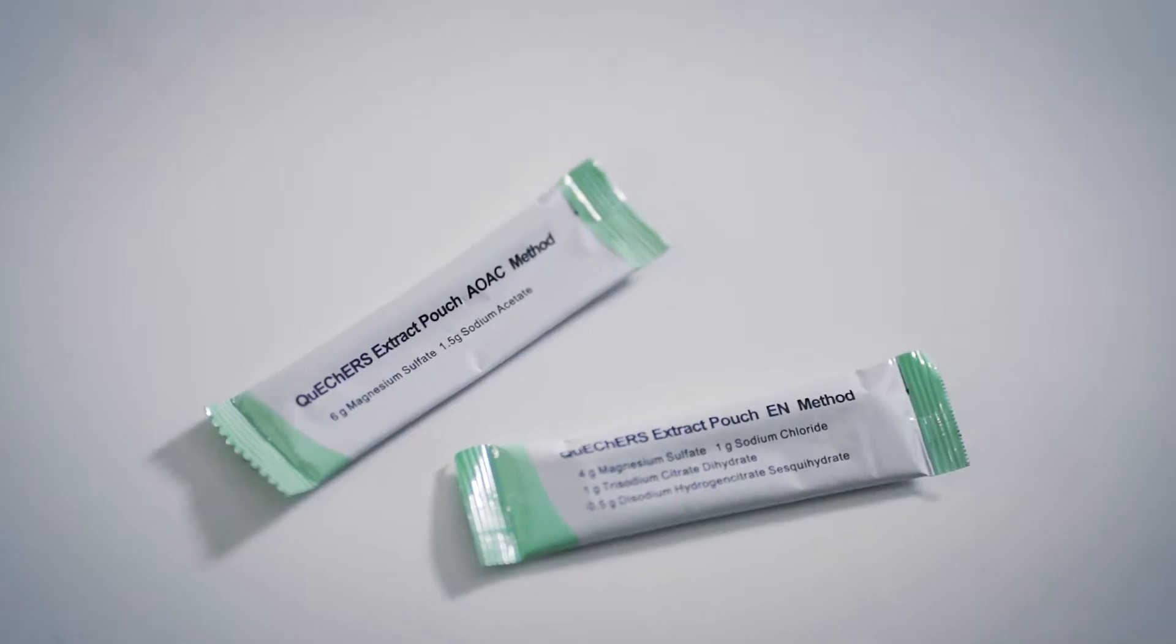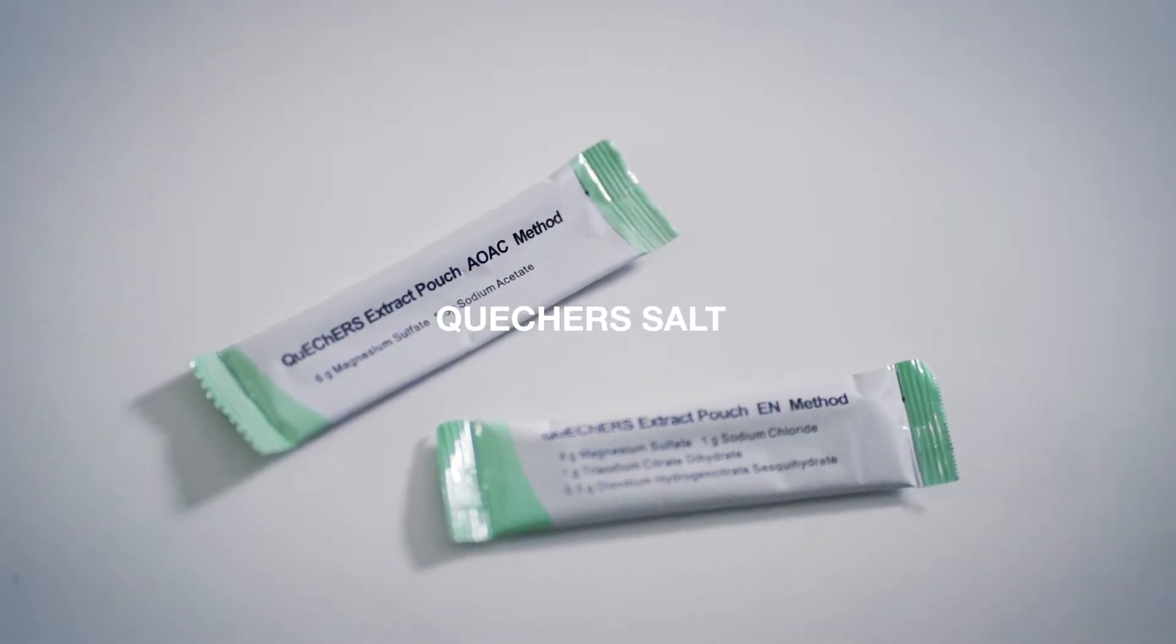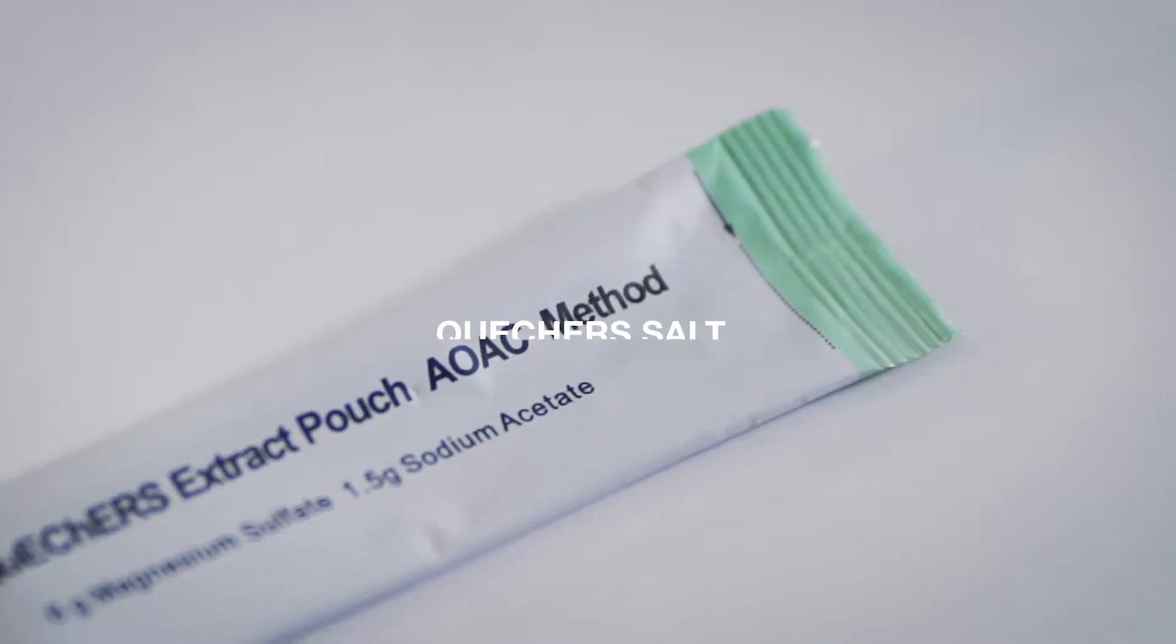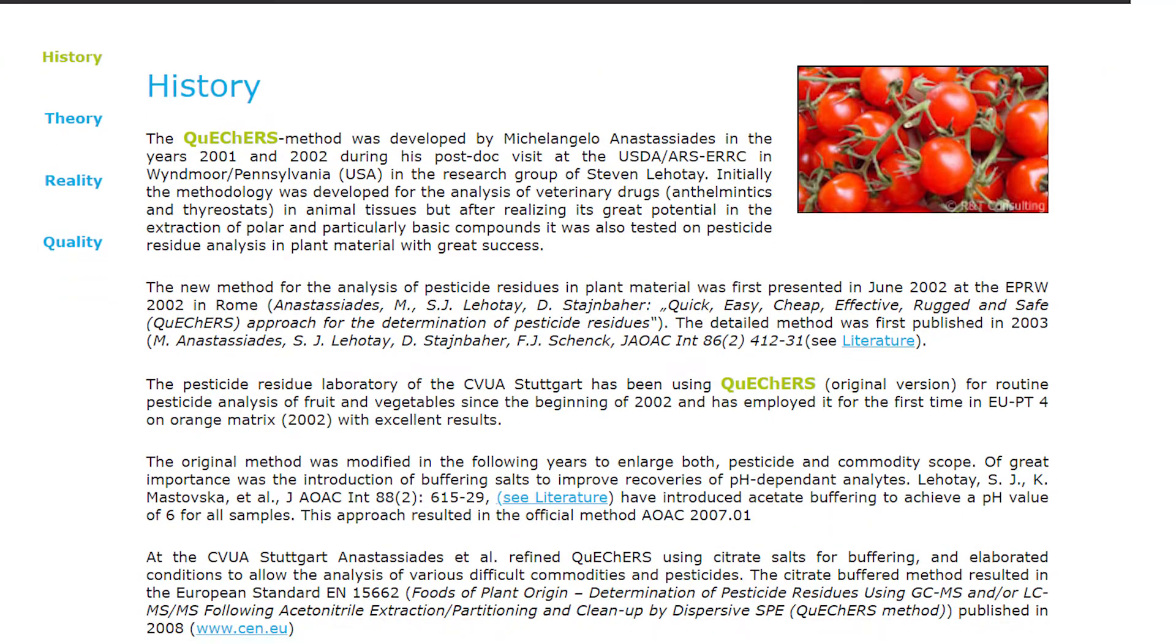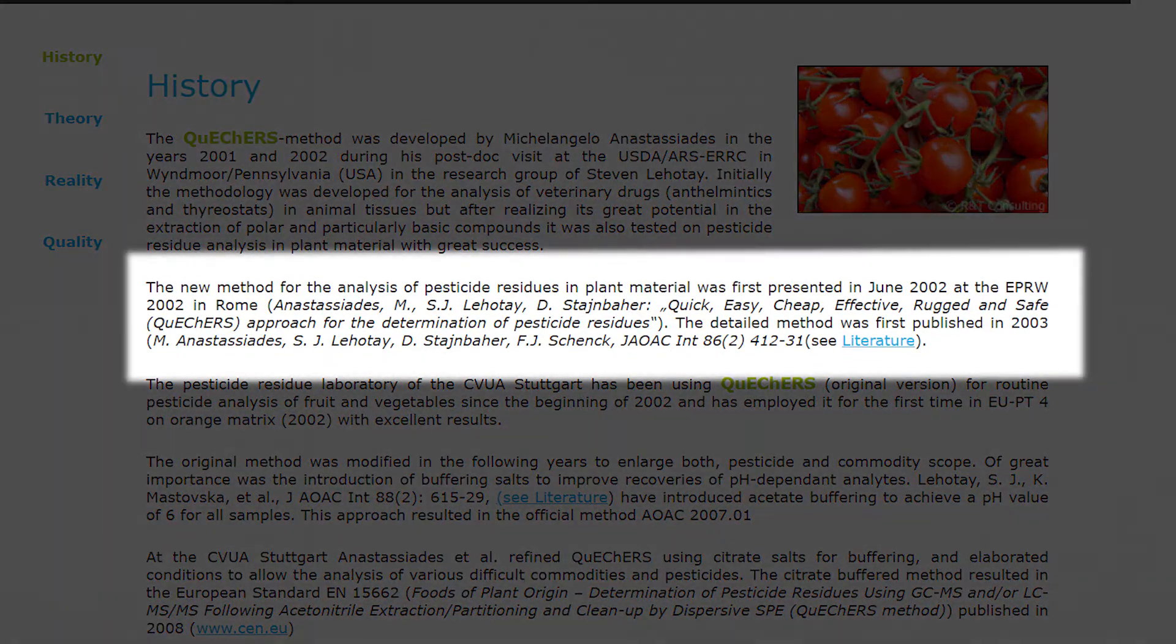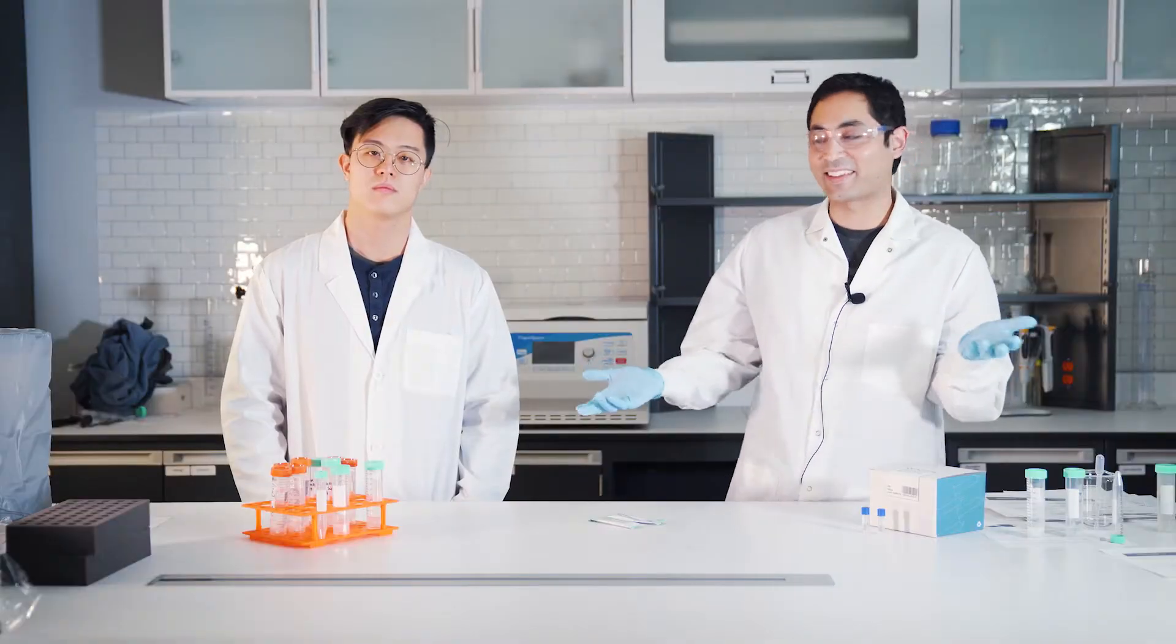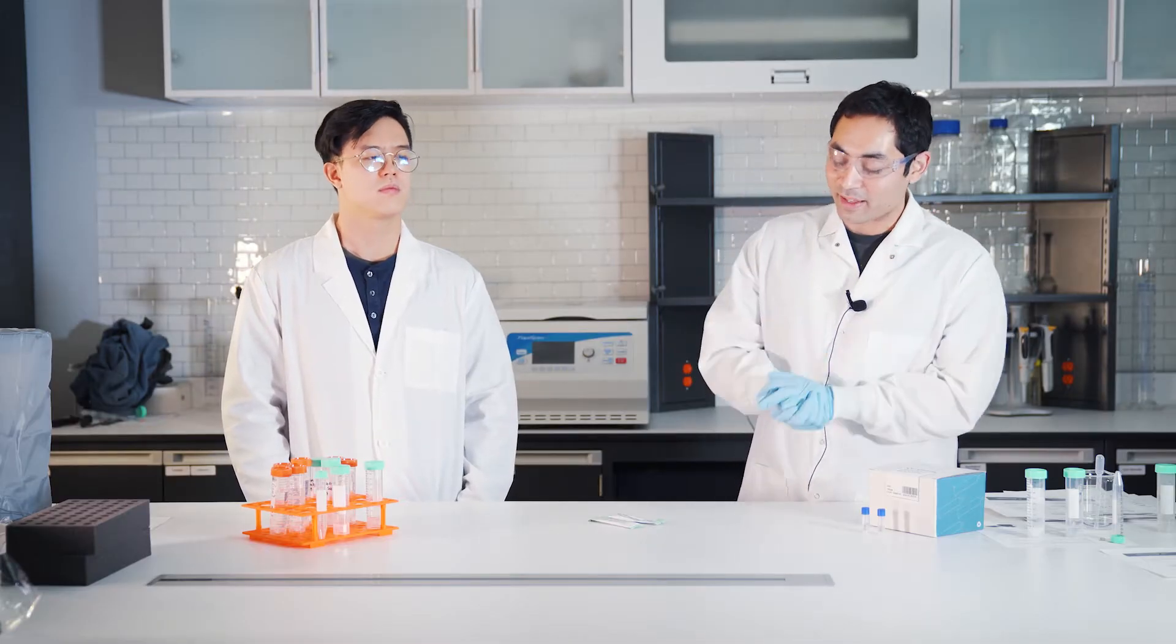First let's talk about the QuEChERS salt. There's two methods. The first method was an AOAC method. The guys that came out with this method are Anastassiades, Lehotay, Stajnbaher, and Schenck. They're getting a lot of royalties - I don't know, probably not - but they came out with a great method and a lot of people use this.